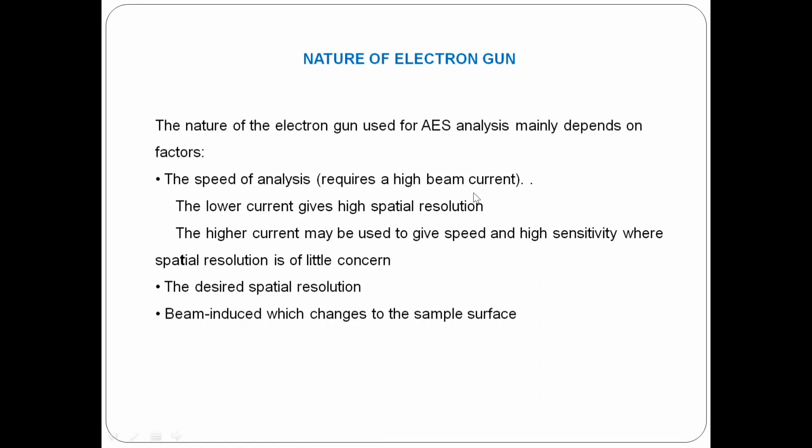But when the current is very high, then it provides speed and it also provides high sensitivity. But the spatial resolution is not as good as it is with a lower current. It also requires a good spatial resolution, and the induced beam changes with the sample surface.